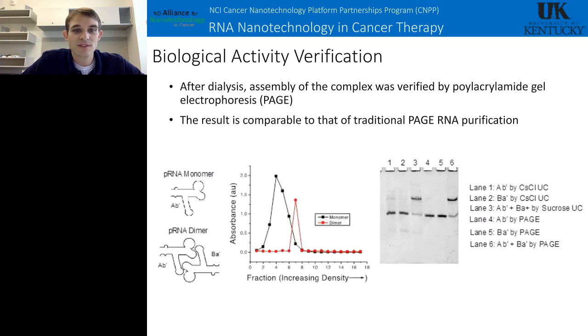So then after this dialysis or ethanol precipitation step, it was important for me, at least for proof of concept, to verify the biological activity of the purified RNA.